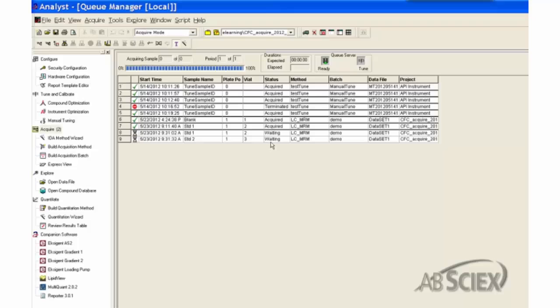When the system queue server shows ready, you can start the queue by clicking the Start Sample shortcut button or selecting Start Sample from the Acquire menu.